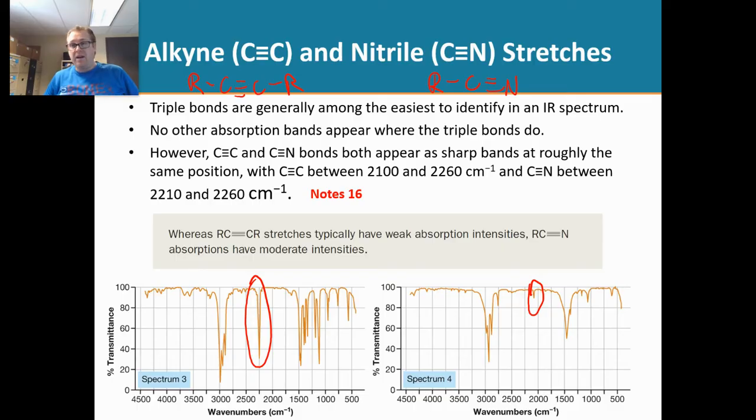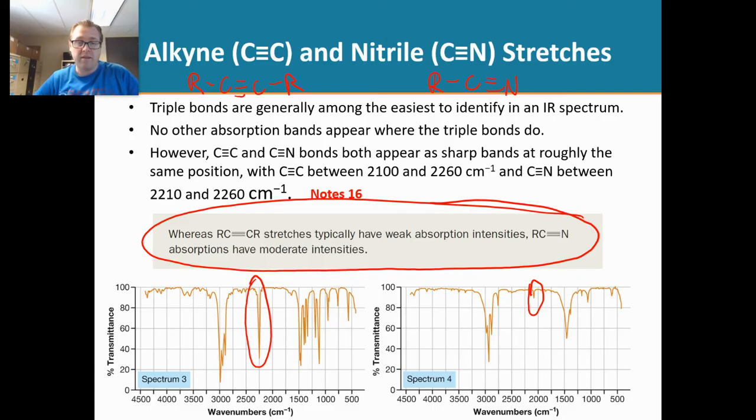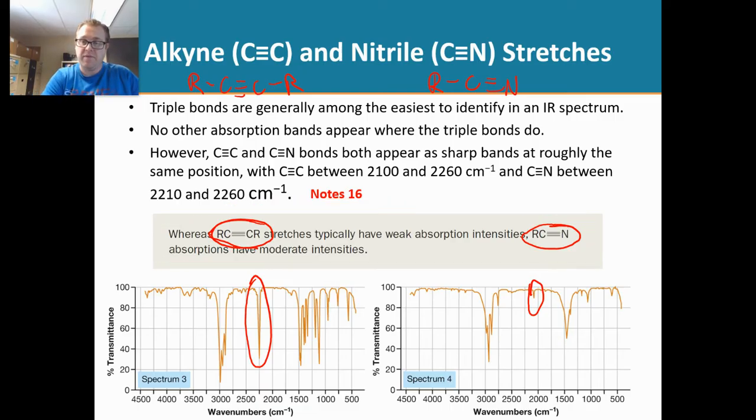Now, there are some differences between an alkyne and a nitrile. And that's kind of demonstrated in this little blurb right there, where an alkyne stretch is typically weak and a nitrile stretch is typically intense. So based off of that explanation, if we looked at spectrum 3 and spectrum 4, which one would you predict would be the nitrile? Well, the nitriles are the ones that are more intense. So that one right there would be our nitrile, and the one on the right would be our alkyne.